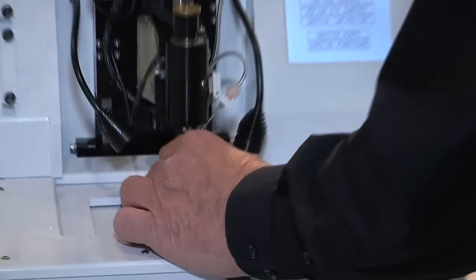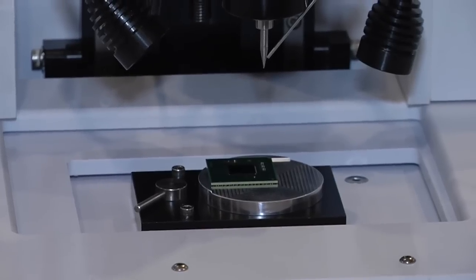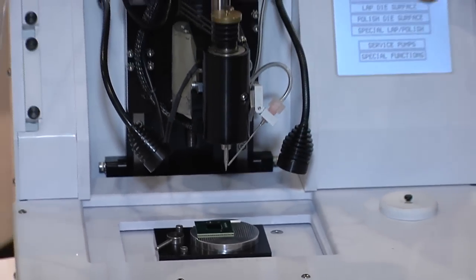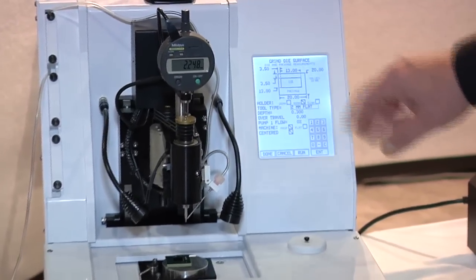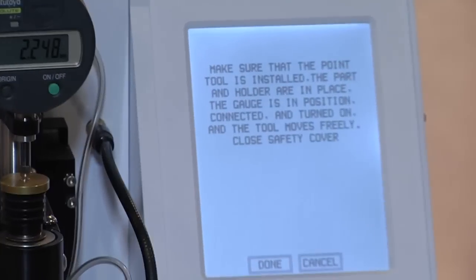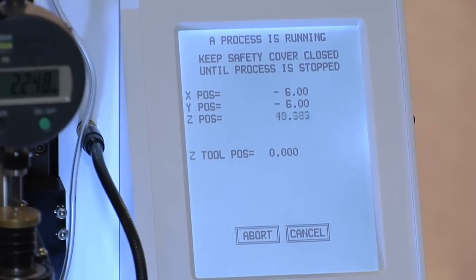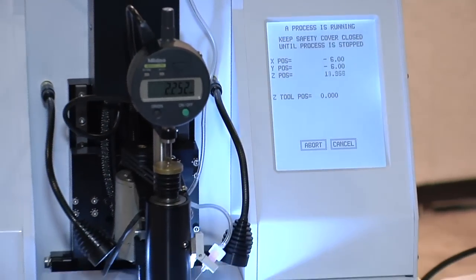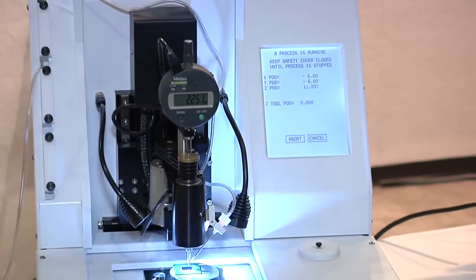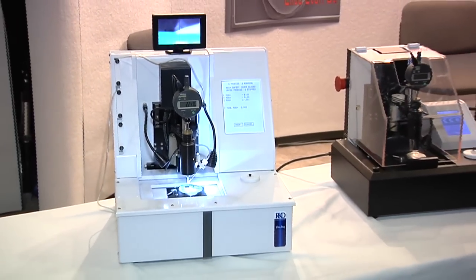The part is placed on the machine, locked in place, and the Ultra Prep — once certain pieces of information are entered into it, such as the package size and the die size — will take critical measurements, measuring the profile of the die surface, allowing the machine to thin the die based on the surface profile as measured by the machine.